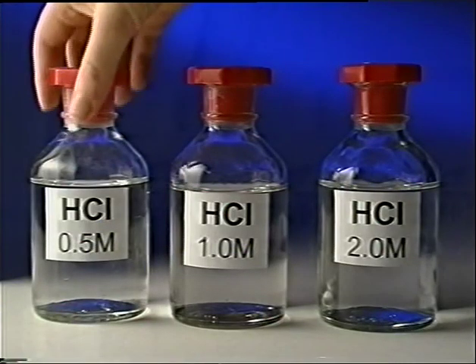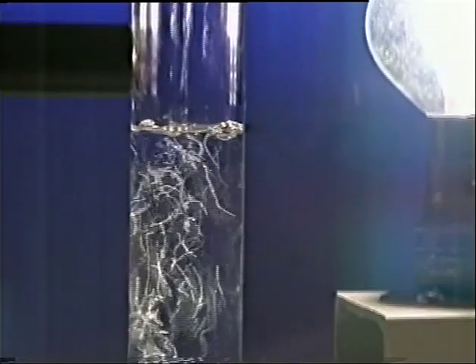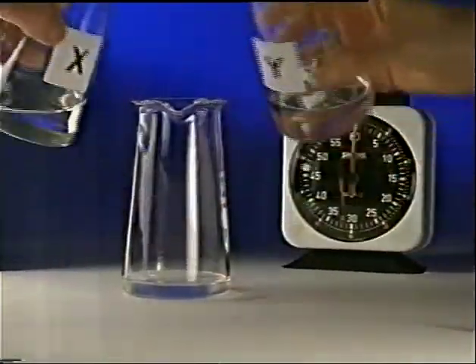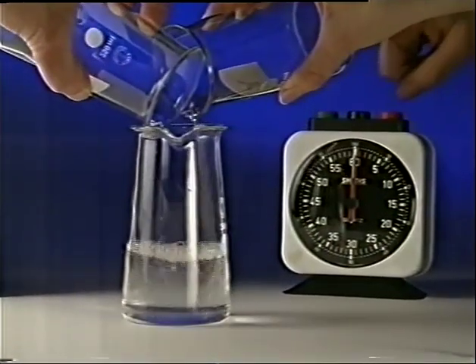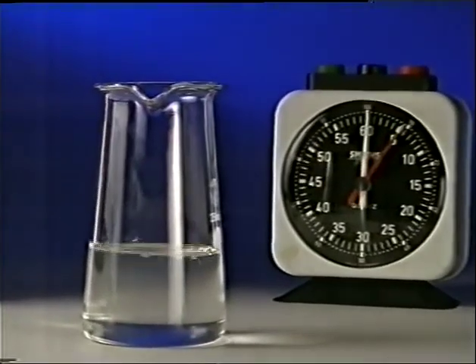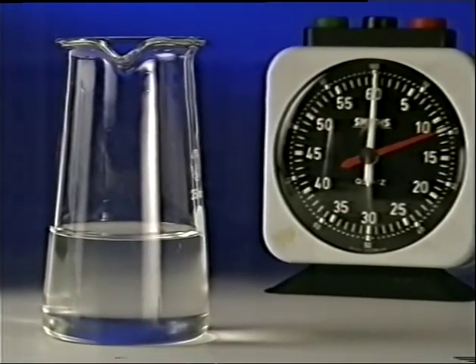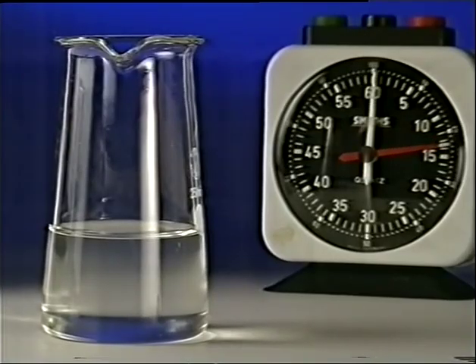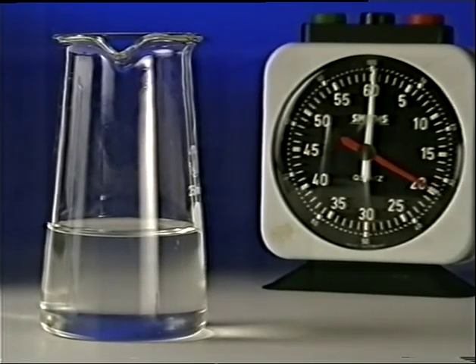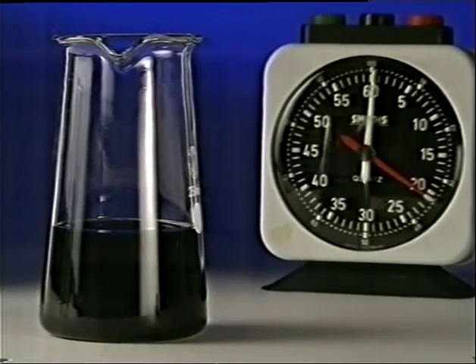Decrease the concentration of hydrochloric acid, and what do you think will happen? With this reaction, the initial mixture is at a room temperature of 25 degrees C. It's colourless, but the moment that one of the reactants is used up, it changes suddenly to deep blue-black. It takes just 21 seconds.